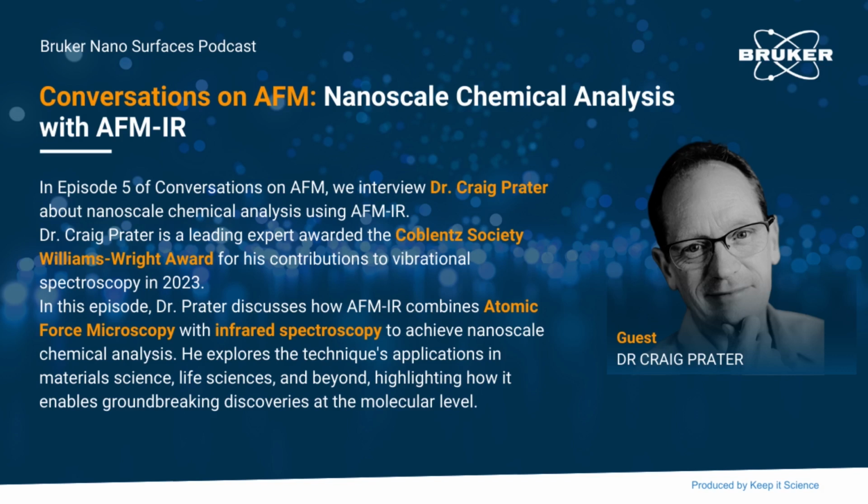And fast forward more than 20 years, after we had tried all of these other techniques for trying to get some insight into what the material was under the tip, we started realizing that spectroscopy could be the potential solution, and started looking for ways that spectroscopy could be combined with AFM.